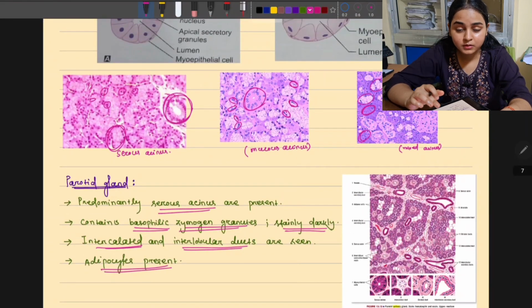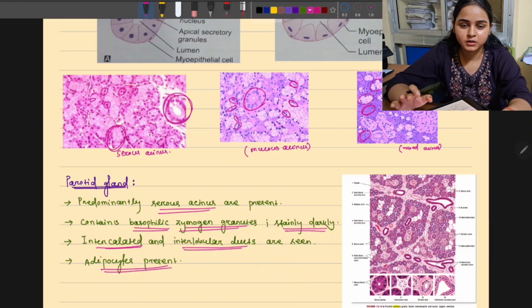और अगर एनाटॉमी में पैरोटिड ग्लैंड लॉन्ग क्वेश्चन आया, तो उसमें भी अगर माइक्रोस्कोपी ऑफ पैरोटिड ग्लैंड आता है तो तुम्हें उसका आइडेंटिफिकेशन फीचर लिखना पड़ेगा, और उसका डायग्राम भी बनाना पड़ेगा साथ में हिस्टोलॉजी वाला.